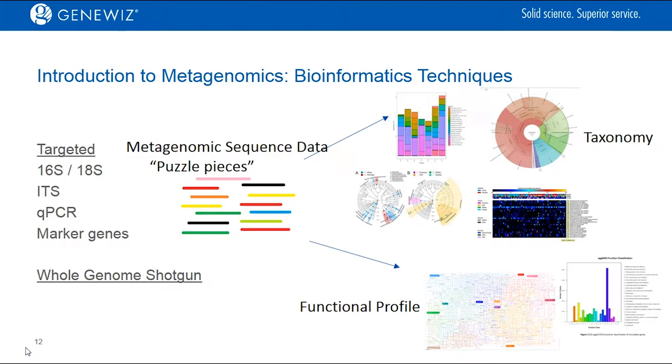Amplicon sequencing, like targeted 16S sequencing, has been widely used over the past decade, but is becoming less relevant as shotgun sequencing becomes cheaper. However, 16S is still useful now, though much less powerful, as it can only be used for classifying bacteria and cannot directly provide a good profile of genes present in a sample.